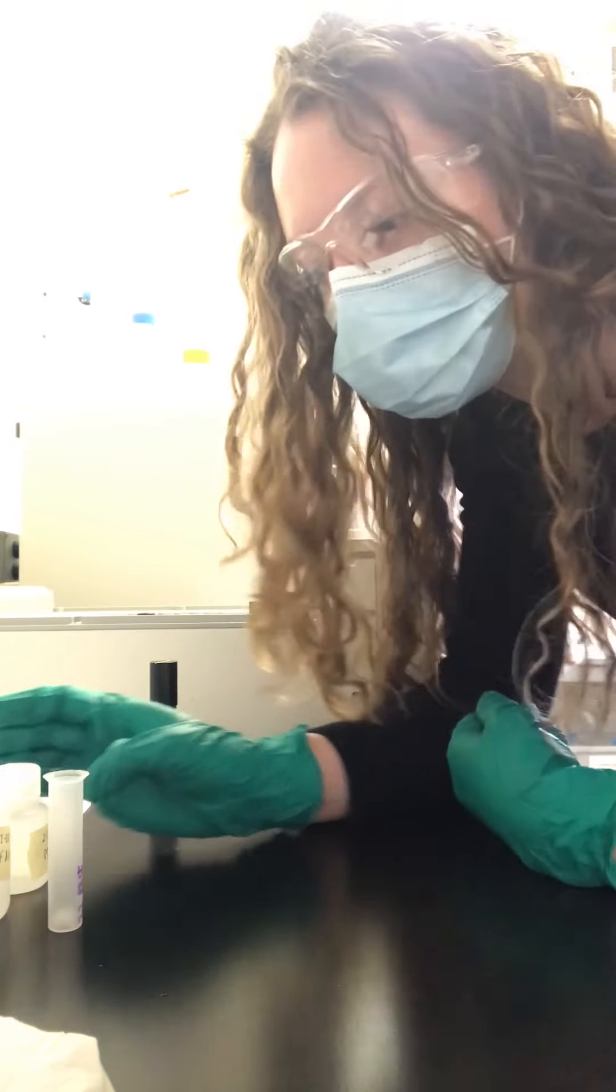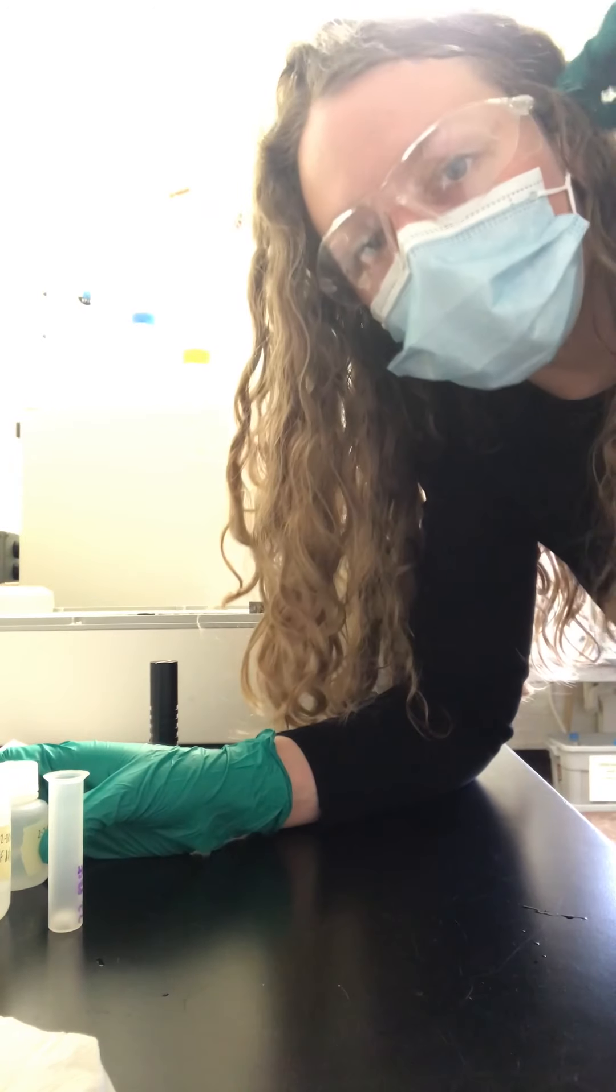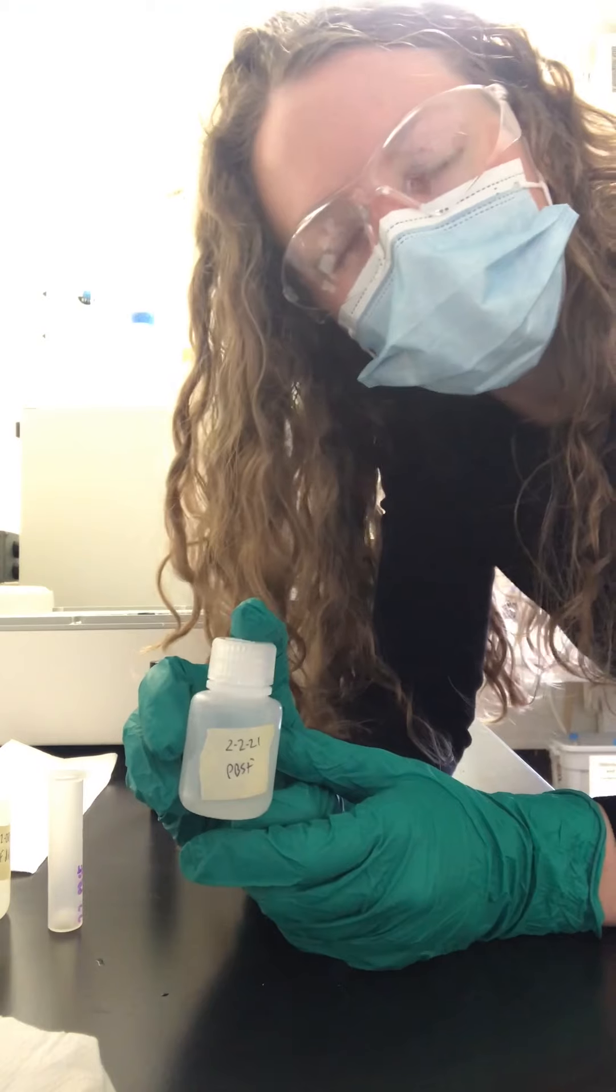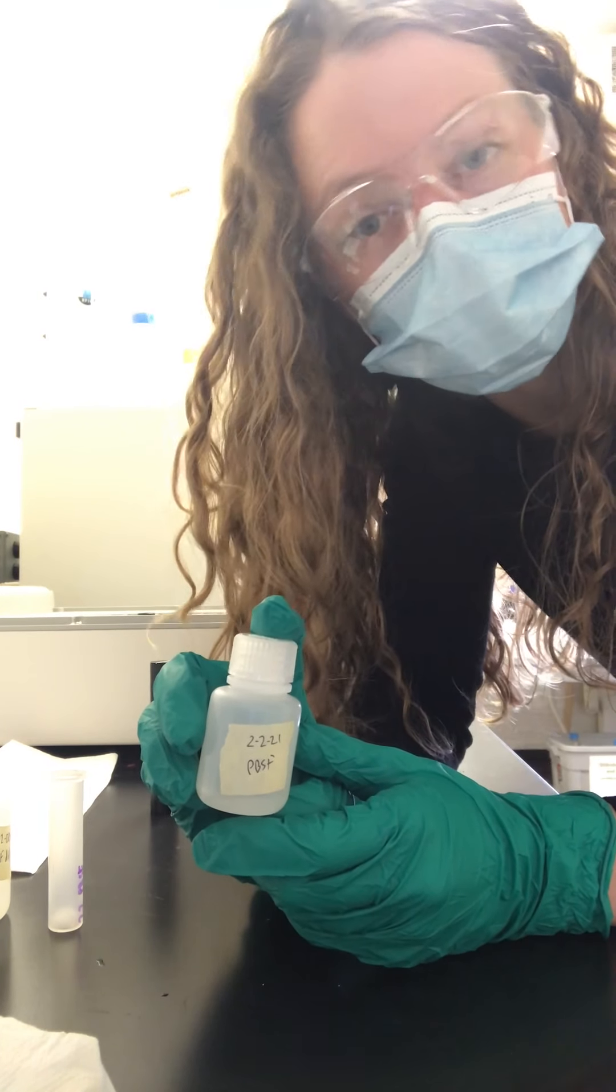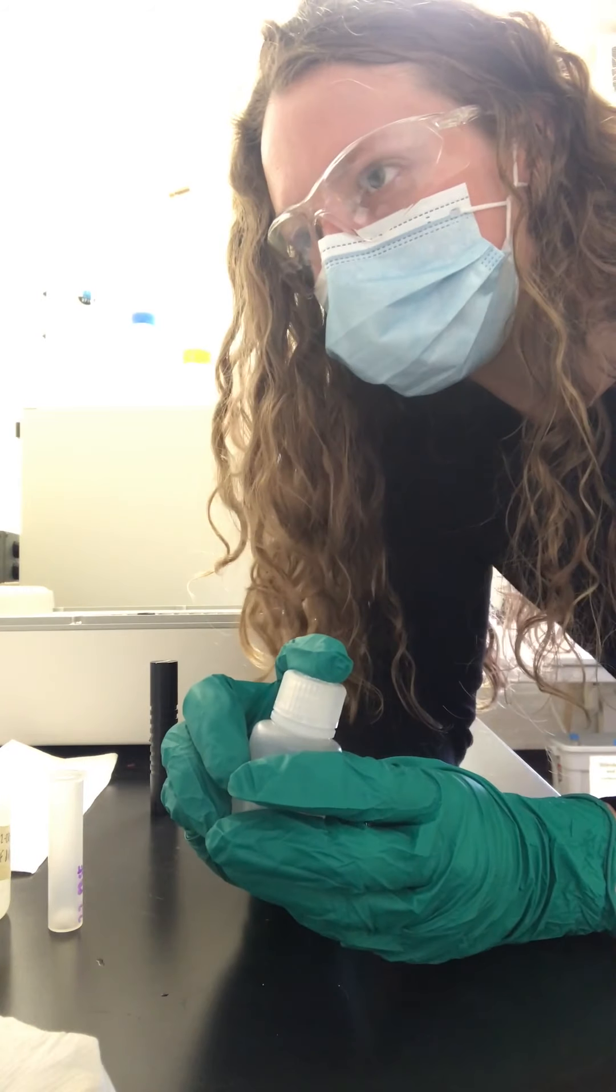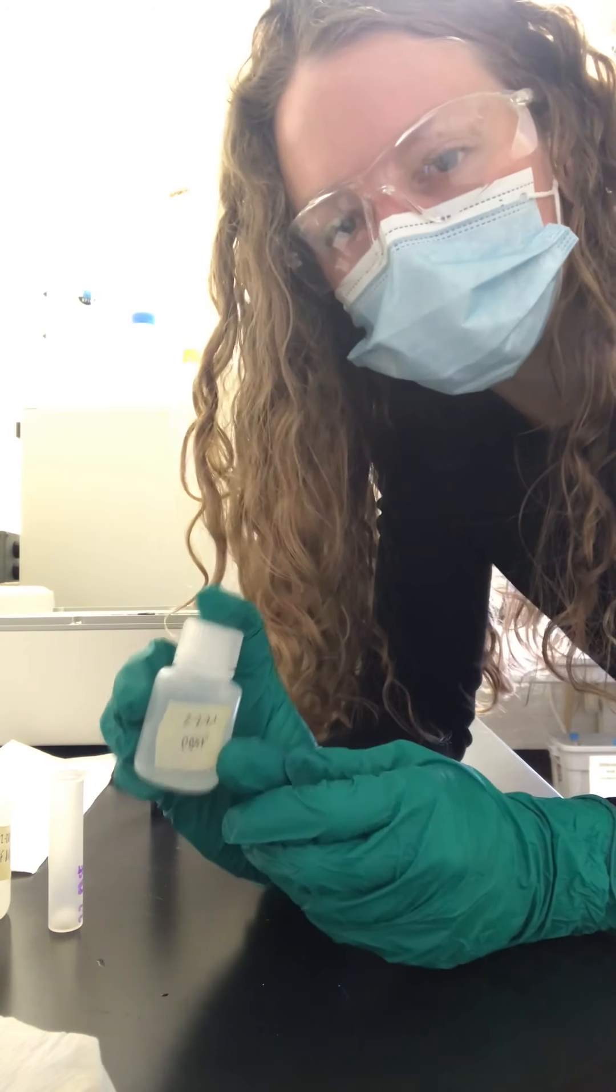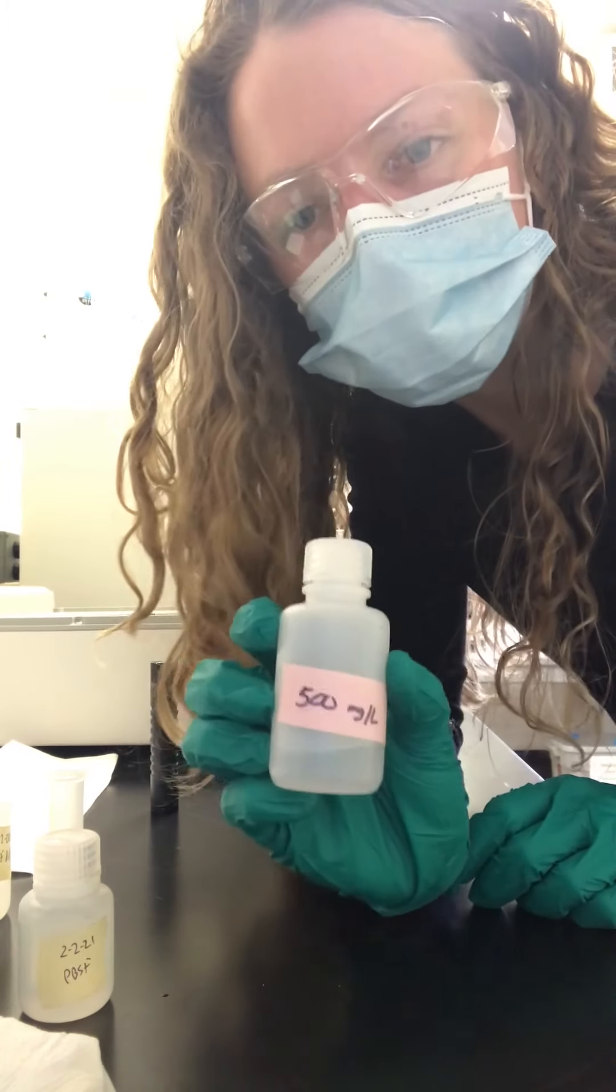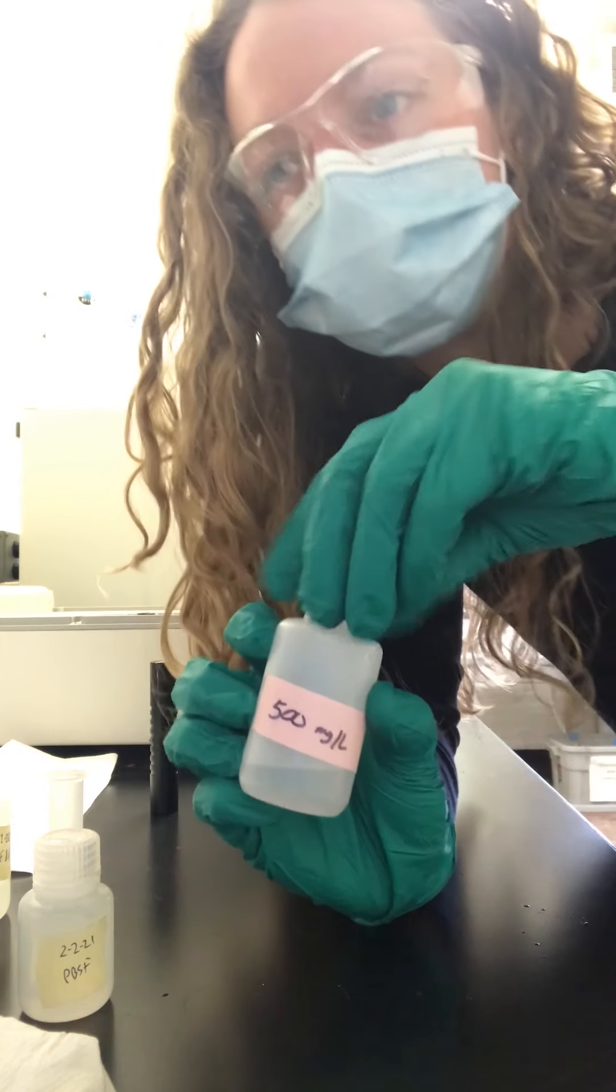When I was out in the field at Pheasant Branch Creek, I collected this water sample. Pheasant Branch Creek experiences really high concentrations of chloride through the winter. Sometimes the amount of chloride in these samples is higher than my highest standard of 500 milligrams per liter.